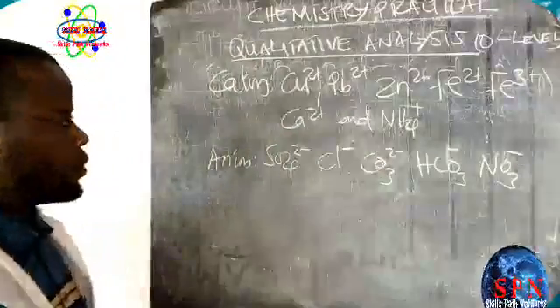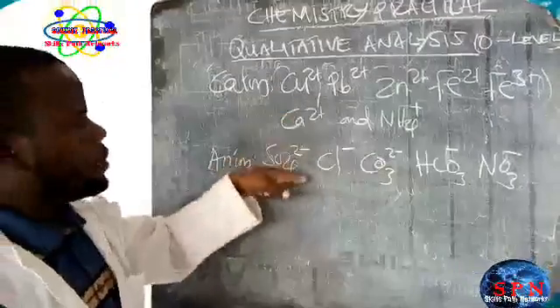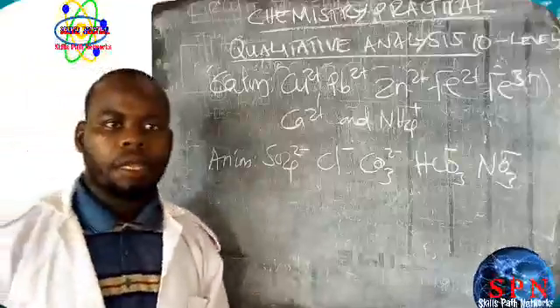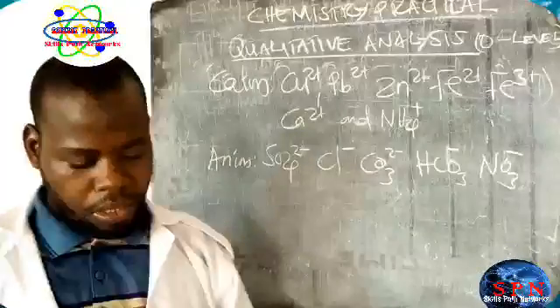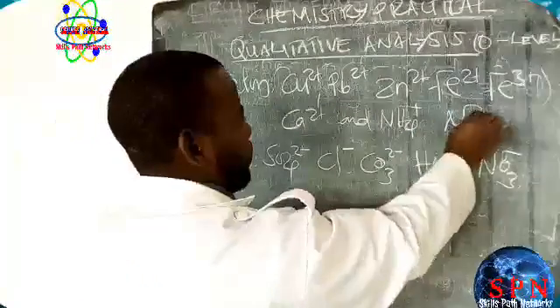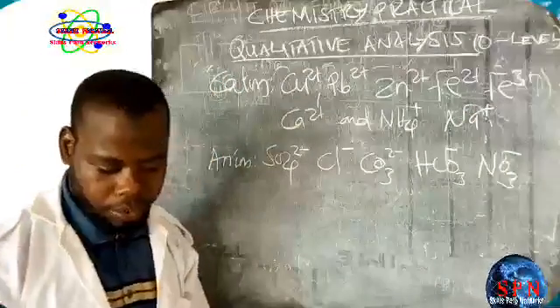That is anion. So the compound can be copper sulfate, lead sulfate, and so on, you take this, you add this one. There are many compounds. That is, the students of O-level should study that one. Here there is also sodium. That is metal.